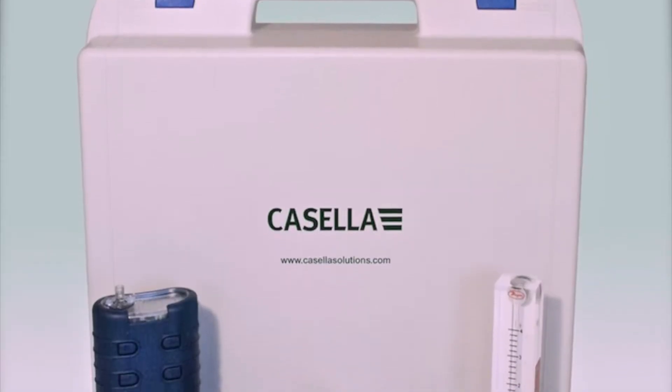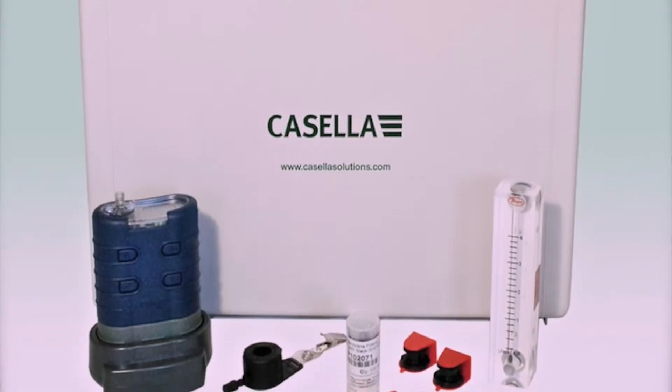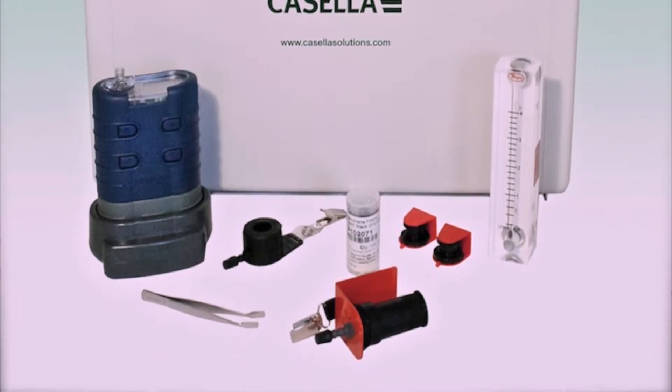Hello and welcome to a Casella how-to video brought to you by the Casella product support team. In today's video we will be demonstrating how to partially lock and fully lock your Tough Pump to avoid tampering with the units during a measurement run.